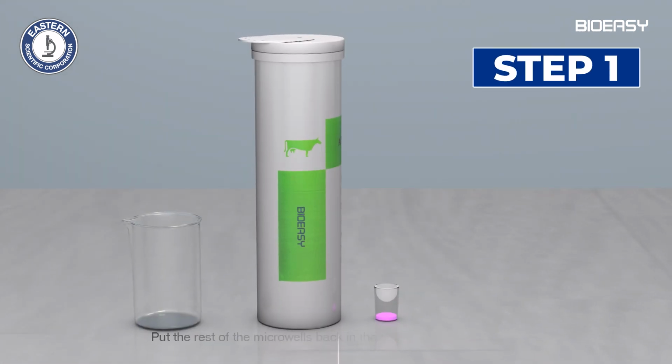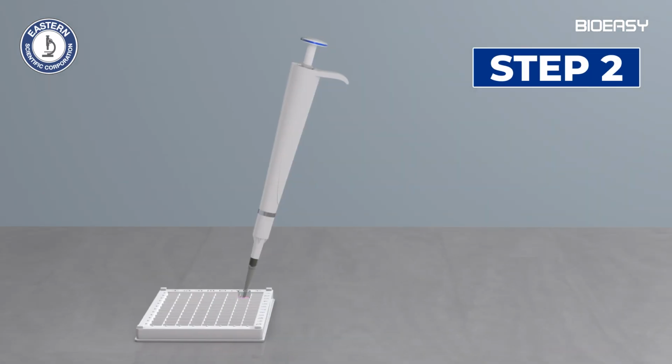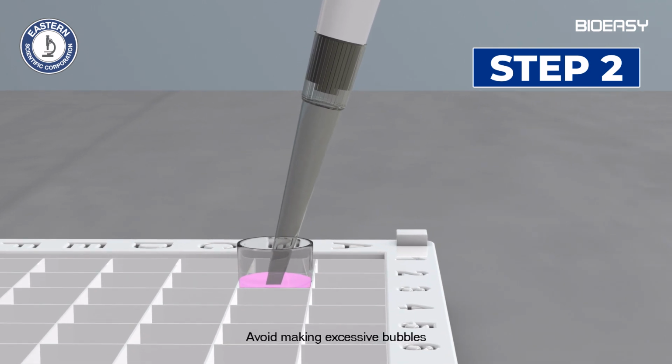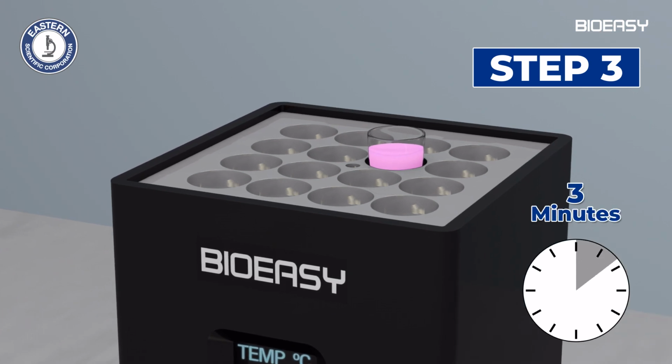Step 1. Take required number of microwells and dipsticks from test tube. Step 2. Pipette 200 microliters milk sample into the reagent microwell and mix well by pipetting up and down 5 to 10 times. Step 3. Incubate 3 minutes at 40 degrees Celsius.